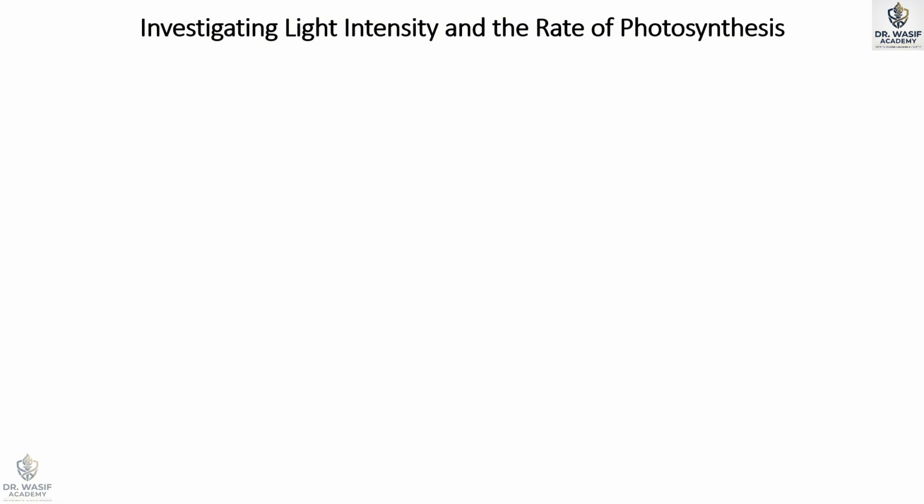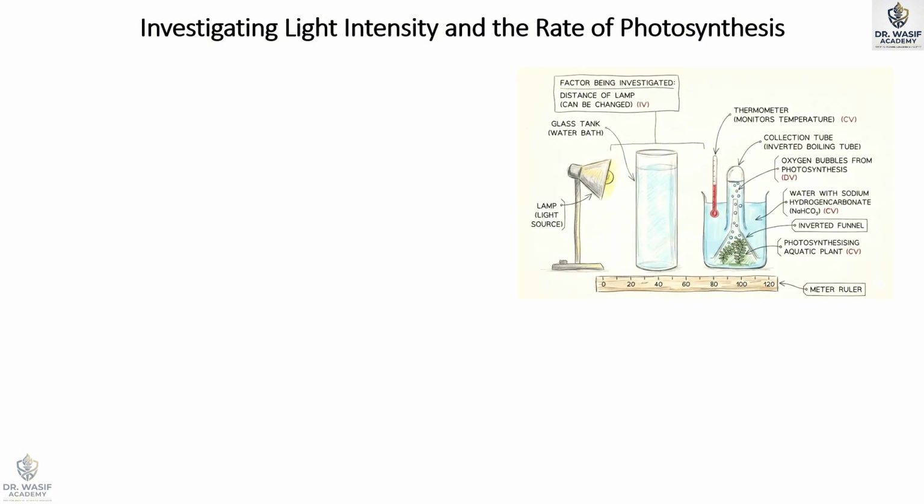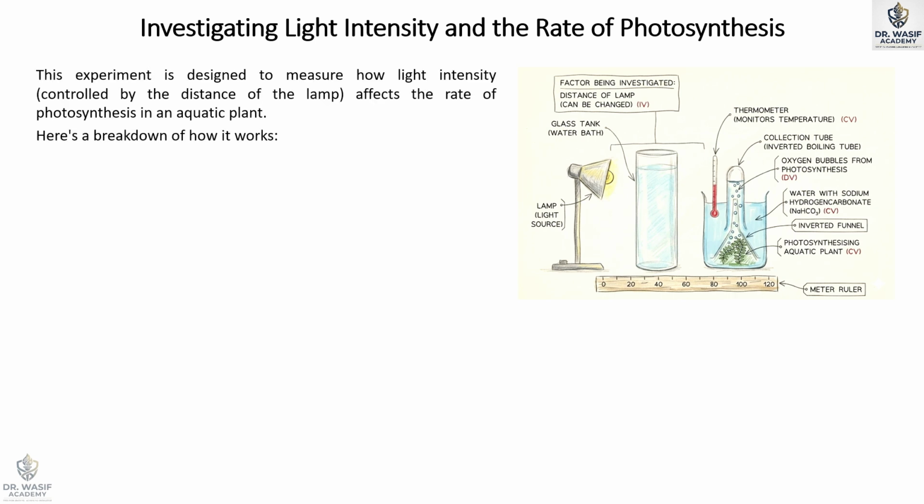Now let's take our theory into the lab. We want to answer a simple question. Does more light actually lead to faster photosynthesis? To find out, we use an aquatic plant like Elodea because we can physically see the oxygen it produces as bubbles in the water.